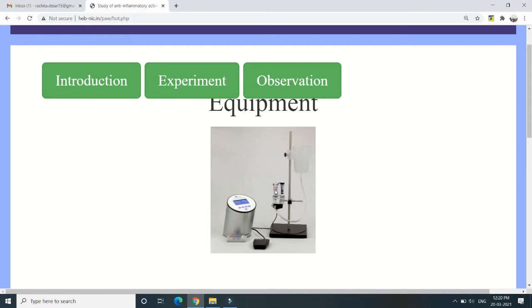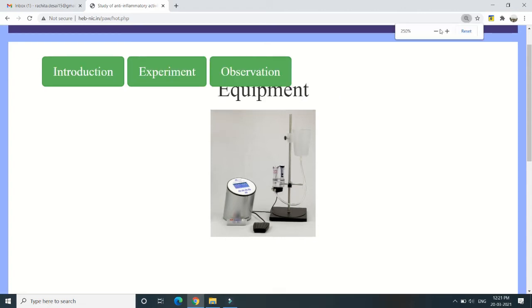We use the principle of volume displacement: when we insert the hind paw into the organ tube, a certain amount of saline is displaced, giving us the volume of the hind paw. For the manual platysmometer, a scale on the organ tube allows manual reading in milliliters. For the digital platysmometer, it is connected to a digital reader that directly displays the reading, so we do not need to manually calculate the volume of displacement.